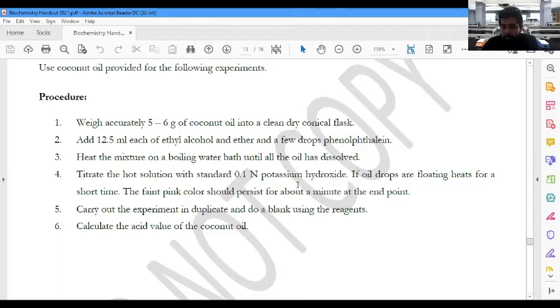Okay, so that is the simple explanation of this procedure. Do you have any questions regarding this? So we have to do a calculation. I request you to take your calculators. Please understand this properly, because this can also appear in your exams.